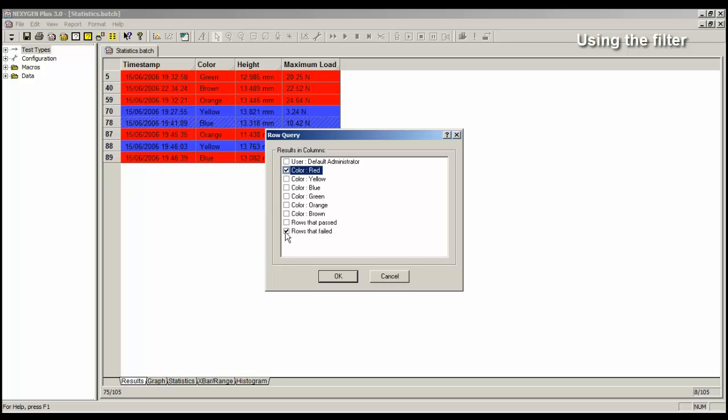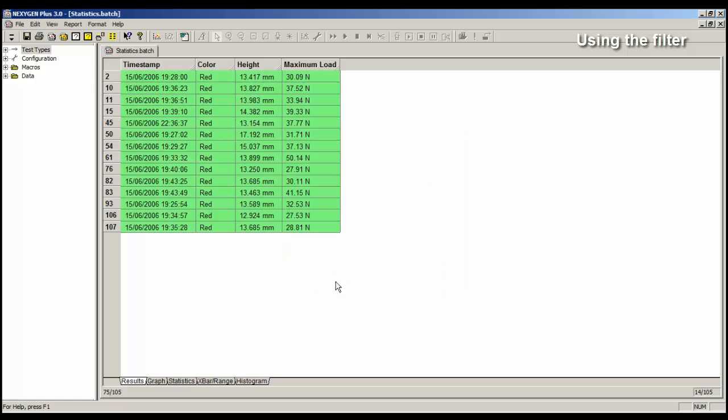I'm going to remove rows that failed because I want to see all of the red samples. Click on the OK button and there is the data for the red samples and in this case they all passed.